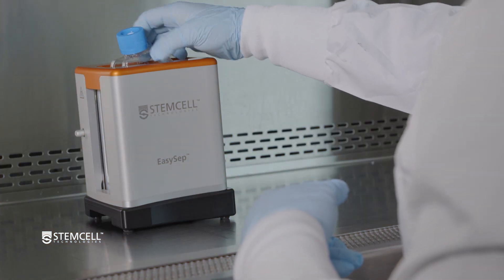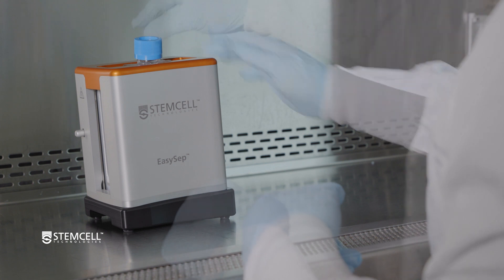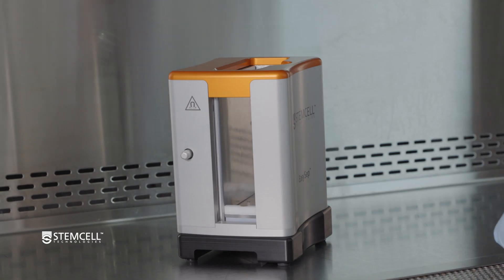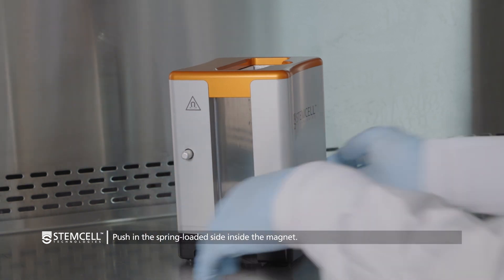Follow these steps to insert and release the T75 flask in the EZ250 EZ-Set Magnet. First, place the magnet on your working surface and push in the spring-loaded side inside the magnet.